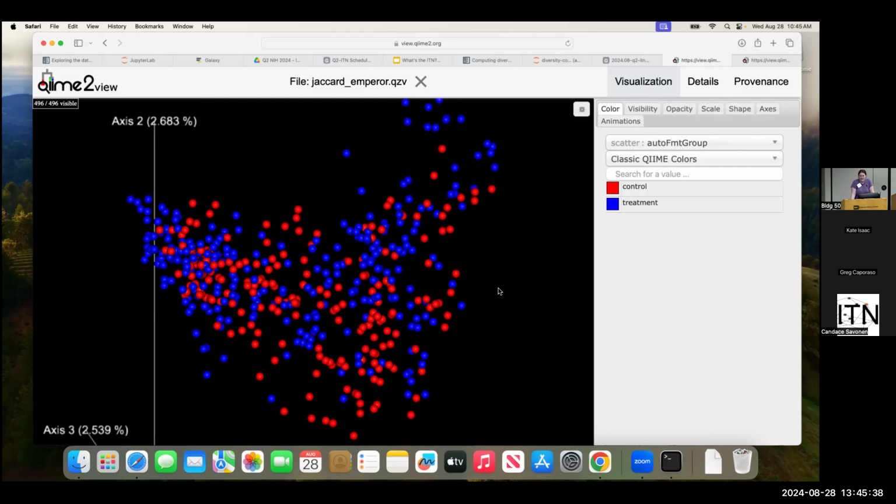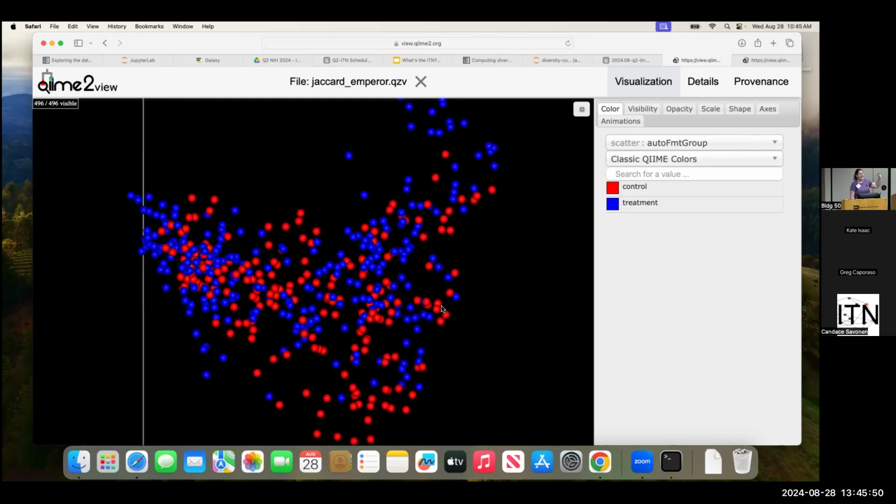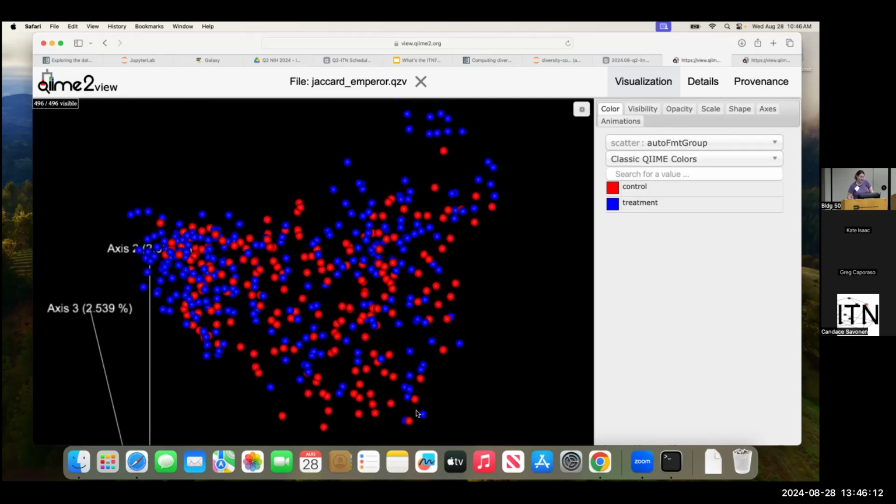So I think it's because it's longitudinal data. This isn't really capturing the changes of a specific subject over time. It's just plotting them all together. And so I think if we were taking into account how the sample was changing from the last sample it had, we would have a better picture of how this data looks longitudinally and how it's shifting and what those differences are. But without taking into account that really core variable of time, change over time, we're not really capturing anything. And so it looks like our signal is really weak.